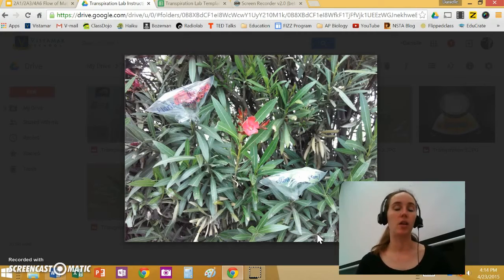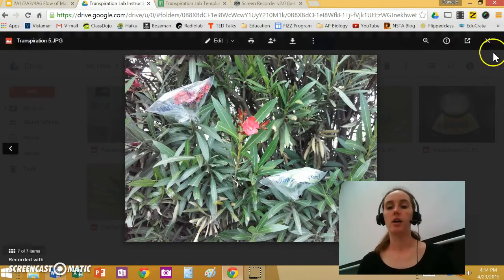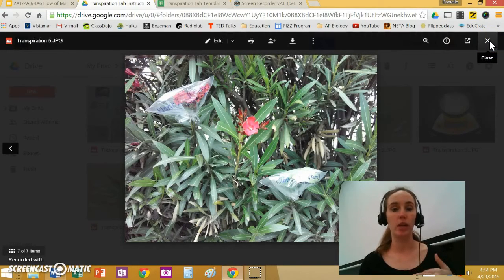I just tell them that no matter what they're doing, they need to have the same amount of plant matter in their bag, so you're ballparking at least the same amount of transpiring matter. And so my team, we're going to wait over the weekend because we're starting that today. But it works usually, especially if you use these plants.